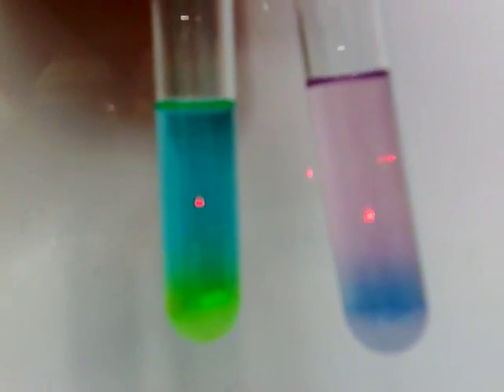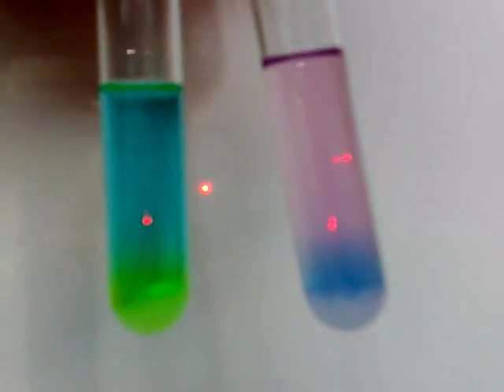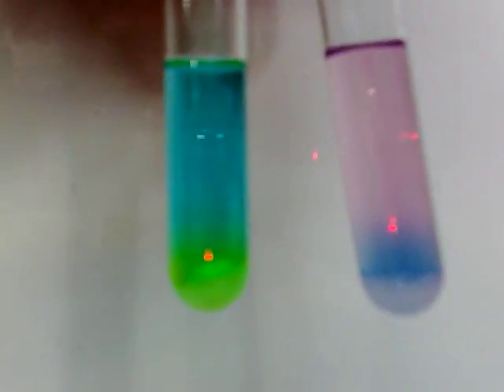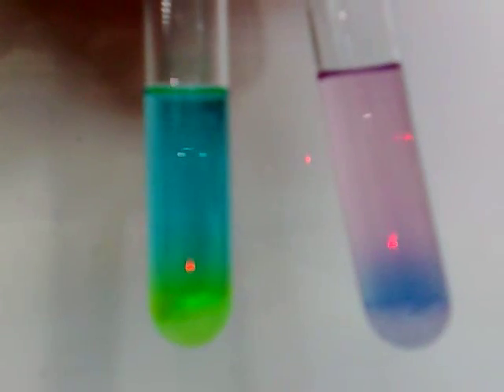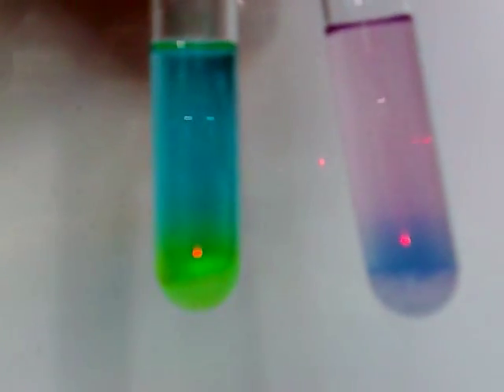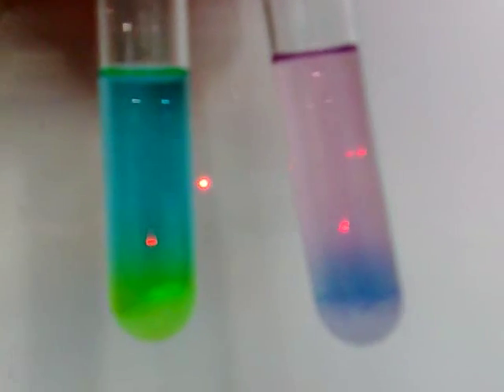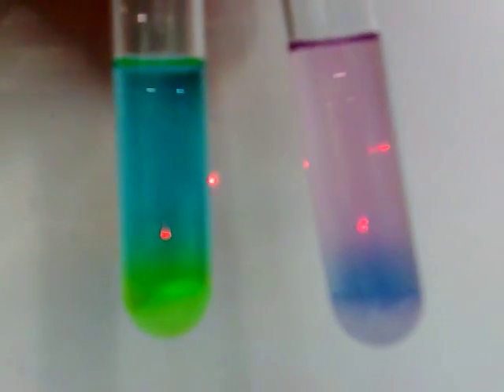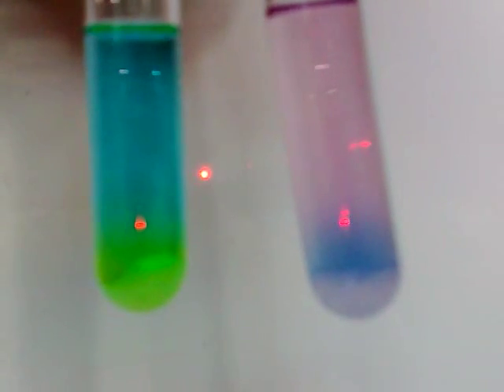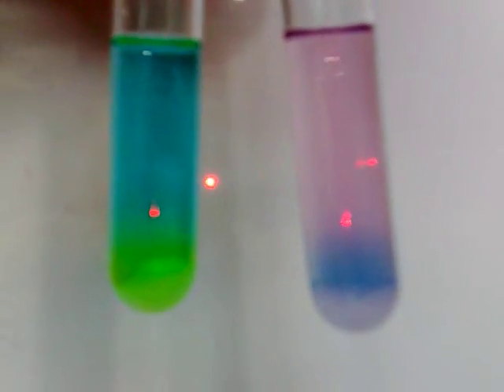...copper sulfate hydrates and cobalt chloride hydrates. The copper sulfate will turn green, where all the water molecule ligands are being replaced by chloride ions. The ligands of cobalt-2+ ions are now replaced by chloride ions, and at the bottom of the right test tube it is blue.